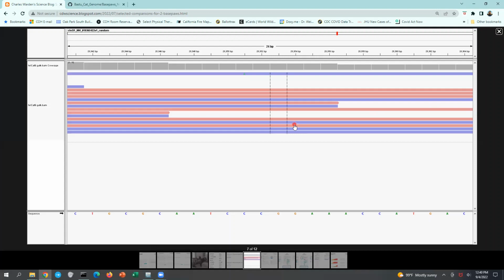to be able to use the same scripts for her second sample. It was a little while before I received that data, but essentially, if I'm trying to describe what Basepaws I believe I acknowledged before, I didn't have that data available at that time, so that's why I'm just focusing on the first whole genome sequencing data for the sake of trying to describe that discussion.